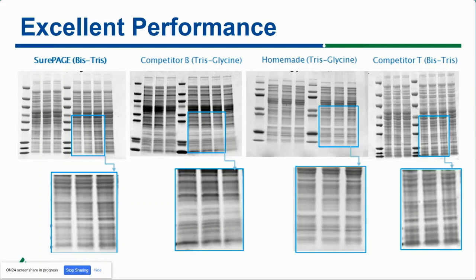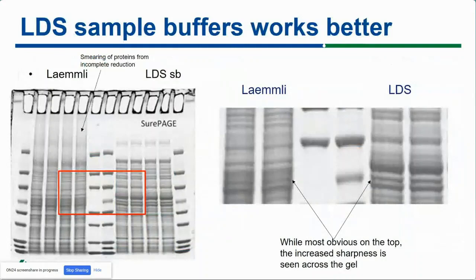Okay, and there are also other precast gels, and as you can see, the resolution is not as comparable, especially from the second gel from the left. There are some missing bands in the middle, and so this just shows some of the details of the gels that we have.